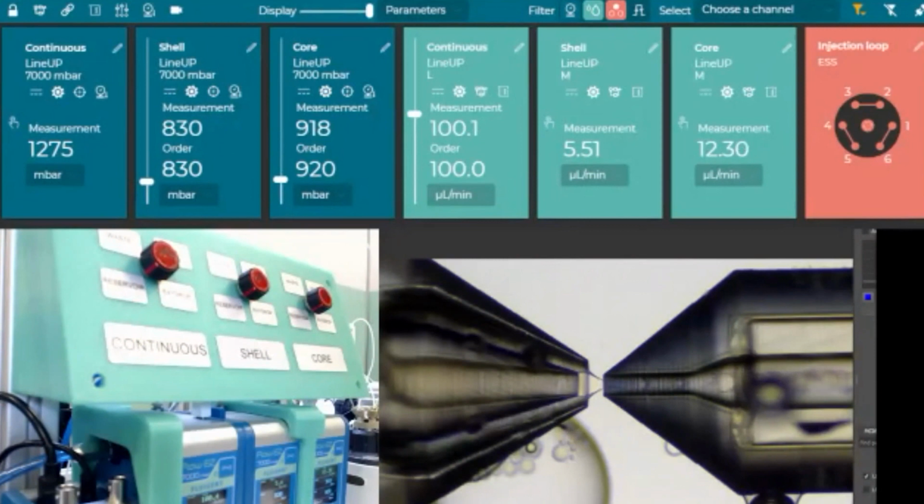Yes, exactly. This is something that we have to think about, because during your analysis you will see the satellites, as, if you are using the FACS with your cells, you sometimes see some debris. And the debris can be sorted as well, so that will be the same for the satellites. So for this configuration, yes, there are satellites, but this is not a problem. For instance, what produces the satellites is the addition of a component to the continuous phase. It's really the one that is creating this behavior, actually.